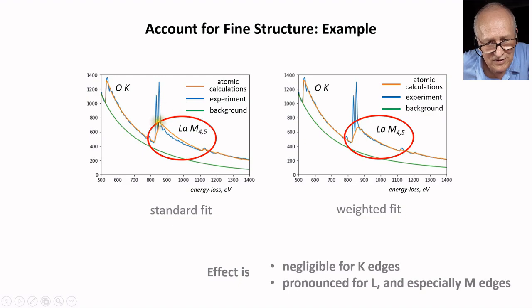So you see that near the white lines the fit overestimates the experiment, and at very large energy logically it would strongly underestimate it, but when we switch the correction on, the fitting is quite reasonable.